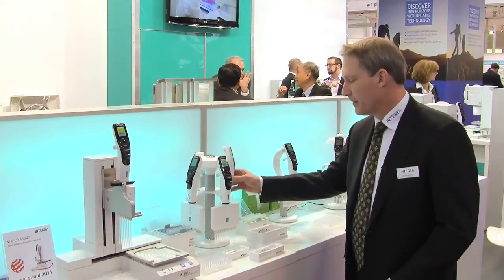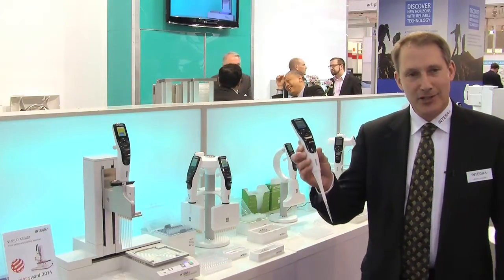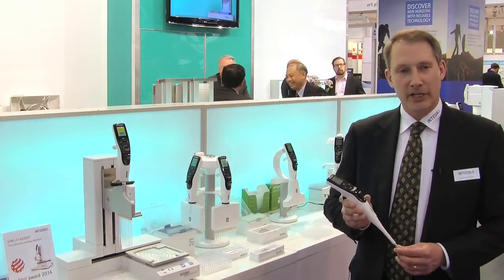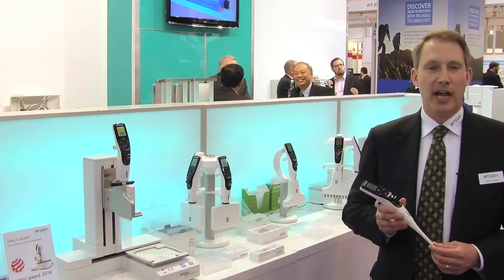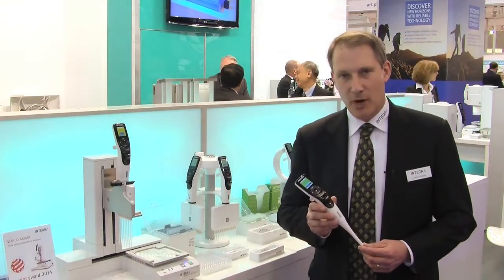Integra makes a variety of electronic pipettes — in fact more solutions than any other company in the business. We have single-channel pipettes, and we also make 8-channel, 12-channel, 16-channel, and pipettes that have variable pitch spacing as well.